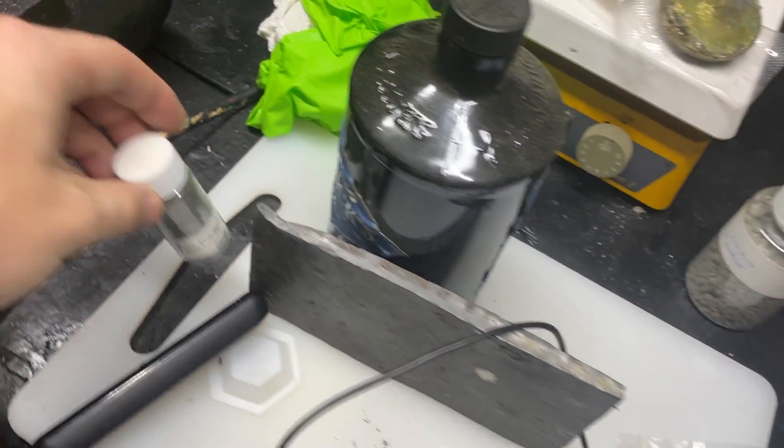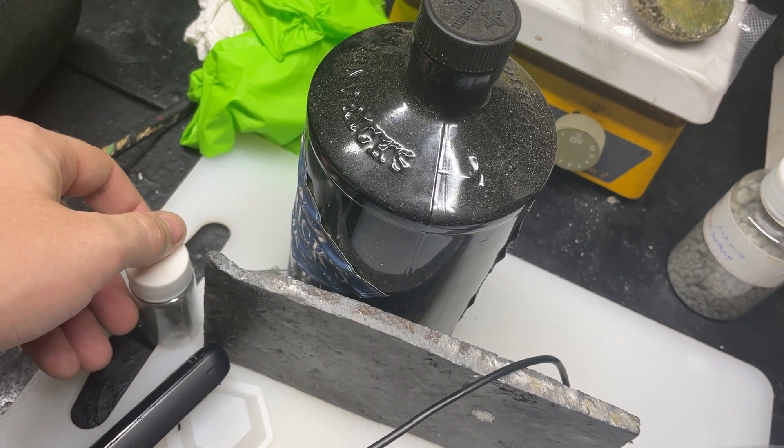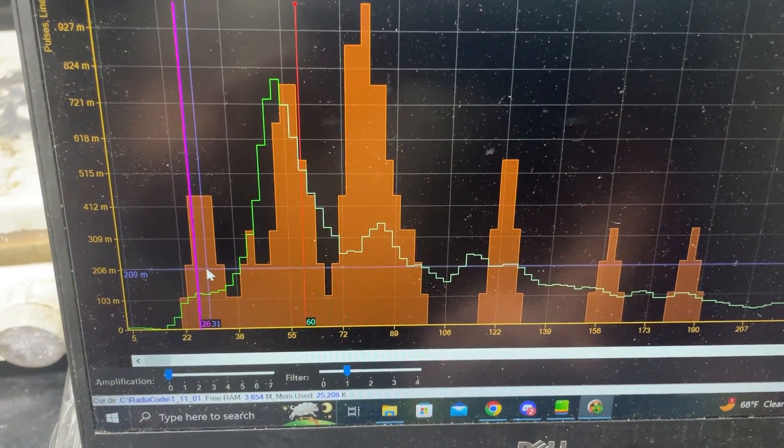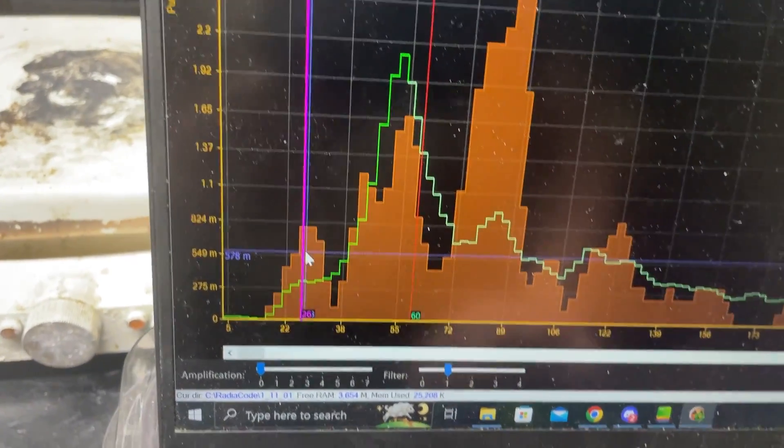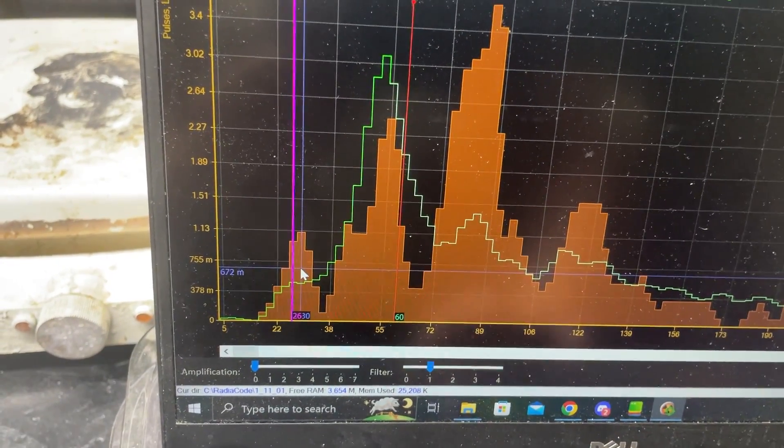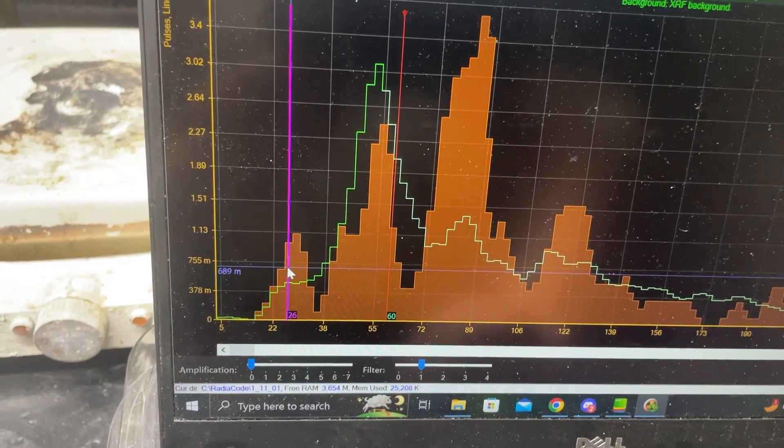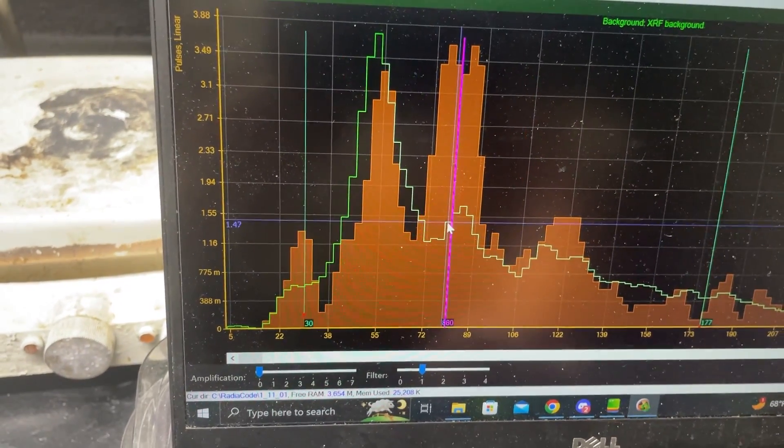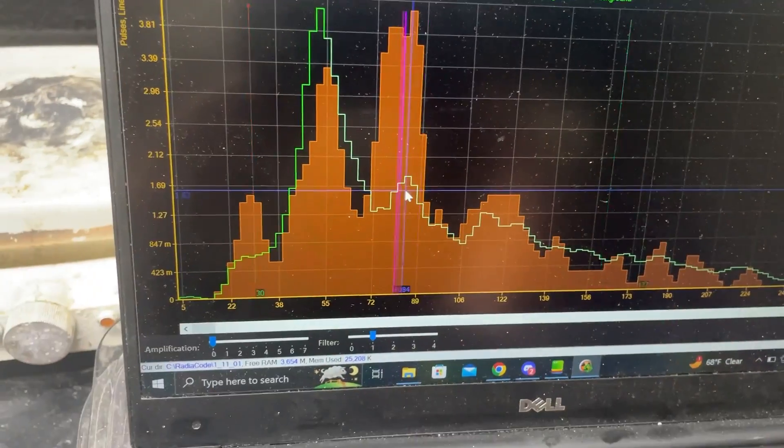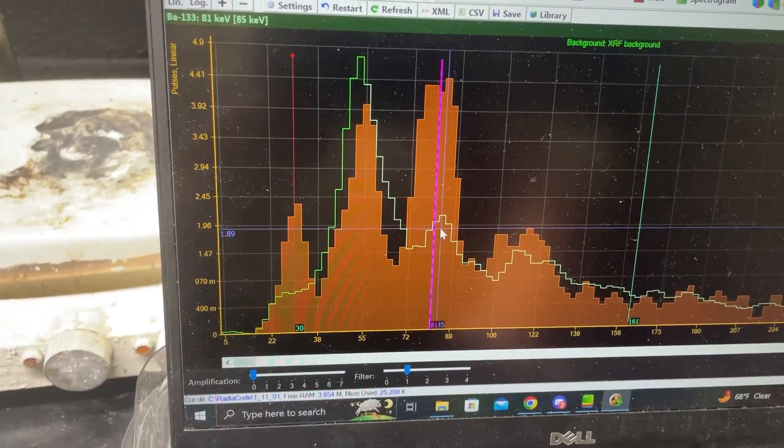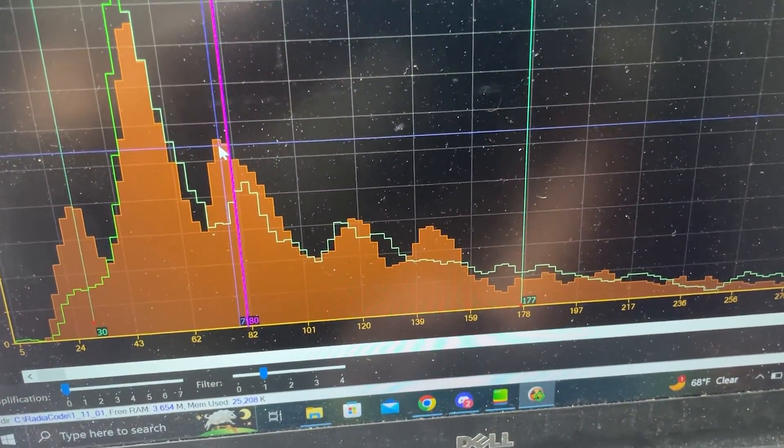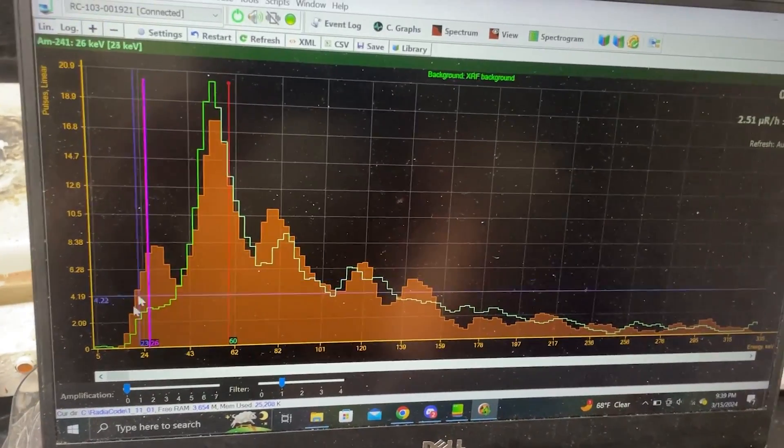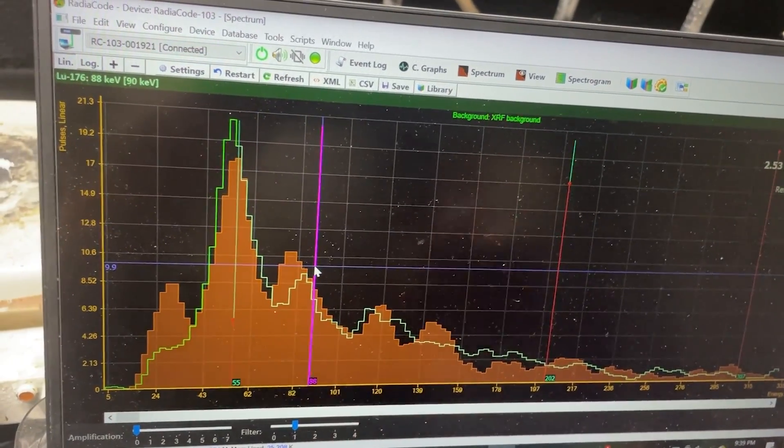Let's do some tellurium. I know another weird element. One of those elements you don't really hear much from. I think we already found our tellurium and we are 12 seconds in. It's exactly what we'd expect from tellurium because its transition is at 30 kilo electron volts minus three. That's 27. So that should be exactly what we're expecting. Oh what are these two peaks right here? What at 85 and 80? Tellurium radioactive? I don't know what that is. It just must contain some radioactive isotope. Anyway I mean we can clearly see our x-ray fluorescence peak right here so no clue what that peak is but yeah.